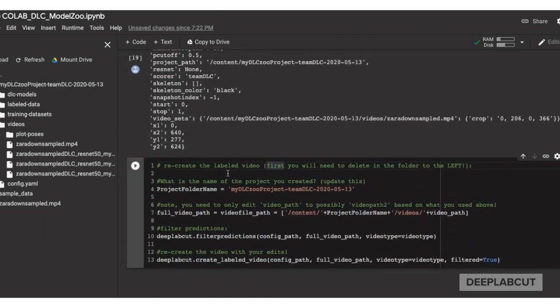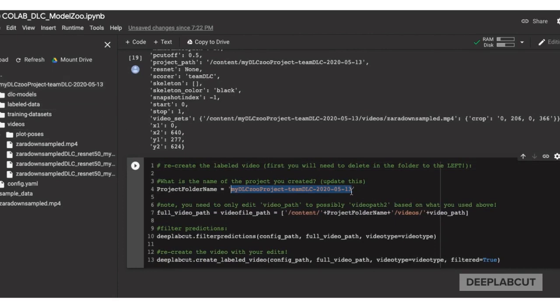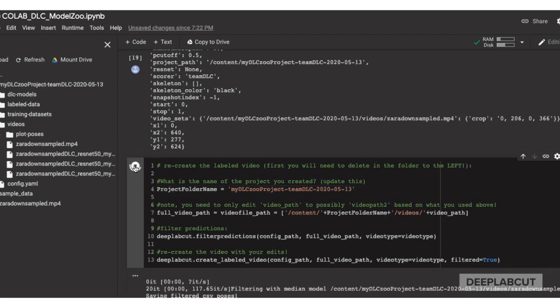And now, in the next cell, what we'll do is we'll just pass the project folder name that you've set so you can look in the navigation to find this to make sure it's set correctly. Then we're going to set the full file path, filter the predictions, and create a new video with these.